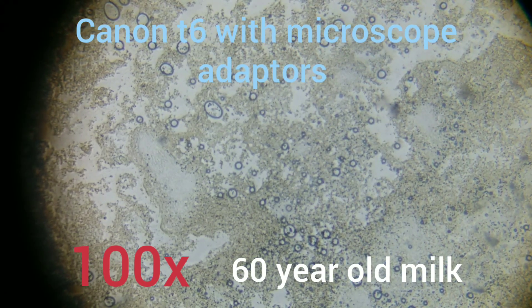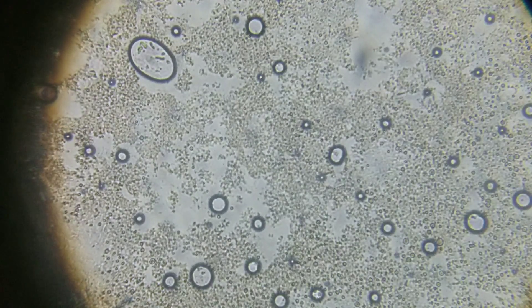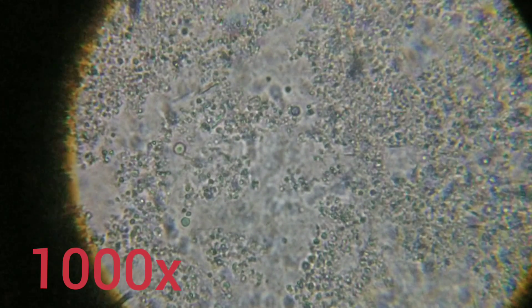This is the 60-year-old milk under the microscope at 100 times, and now at 250 times. It's very possible that the things you're seeing right there might be bacteria cells. The bigger things are air bubbles trapped under the slide. All the really small things you're seeing are fat cells. Now going up to 1000 times — you can really start to see the fat cells, and you can see everything starting to move around with the current in the slide.